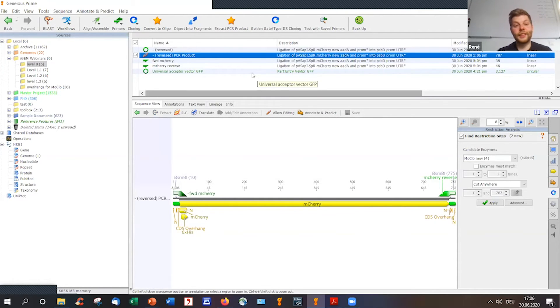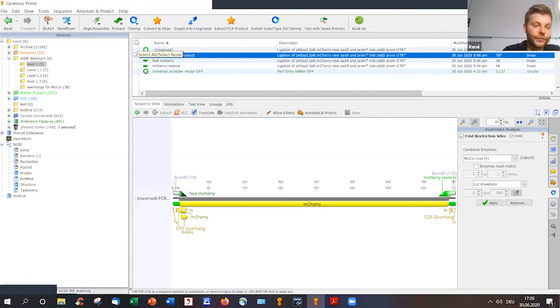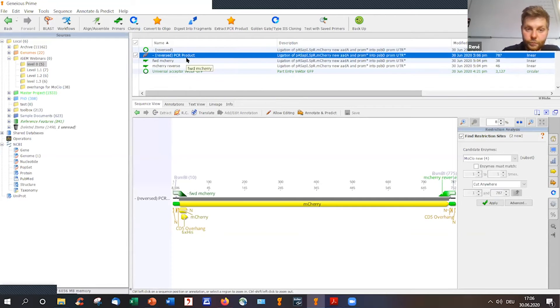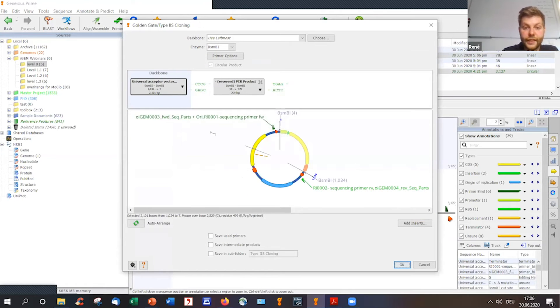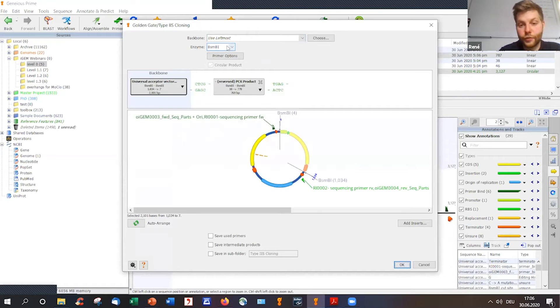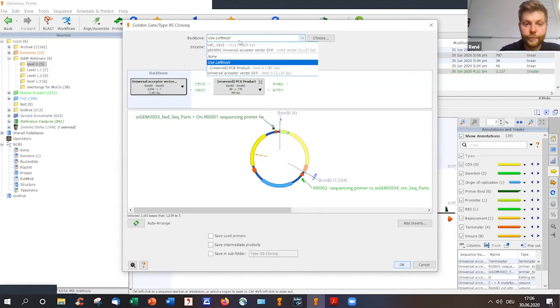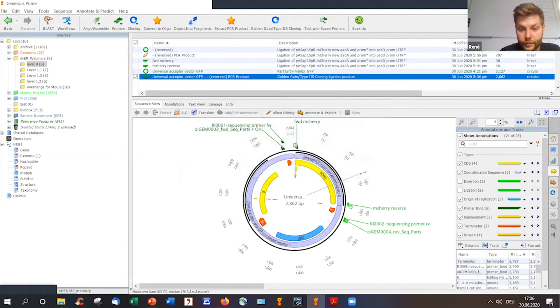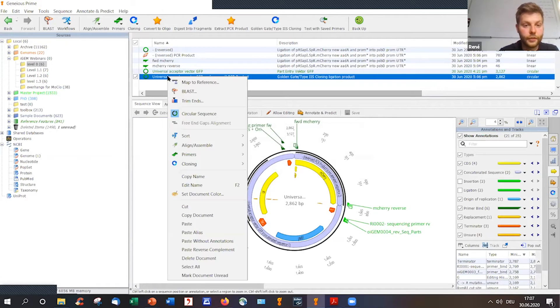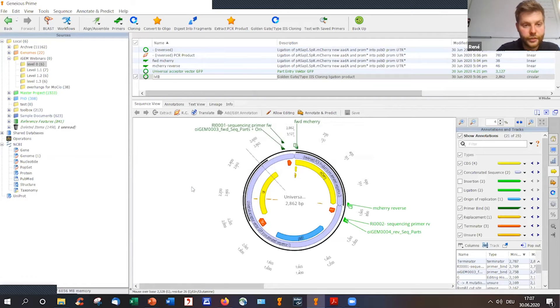Geneious has a very useful golden gate assembly tool. I mark the PCR product, mark the acceptor vector or level zero plasmid, click on 'Cloning > Golden Gate Assembly,' and Geneious recognizes everything on its own. You can choose the different enzymes; for level zero I use BsmBI. Click OK and everything else is done by Geneious. Now my insert is in the level zero plasmid and I just edit the name — 'level zero mCherry' — and we can use that for further assemblies.